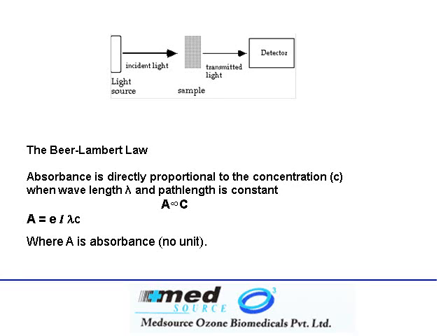And then we can apply the Beer-Lambert's law, which is quite simply saying that absorbance is proportional to the concentration when wavelength and path length is constant. To speak very simply, more is the absorbance, more is the concentration, less is the absorbance, less is the concentration. This will become a little bit clearer when we do an actual example. But just try to understand that Beer-Lambert's law is quite a simple law which simply says more concentration, more absorbance, and vice versa.